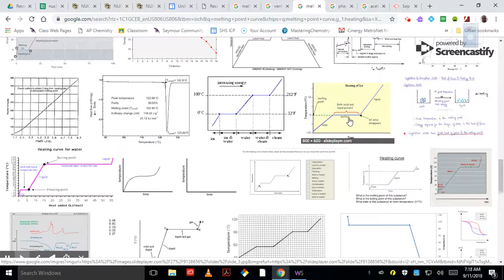Because if you mix acetanilid with acetanilid, you don't have a mixture, and you should see a fixed melting point. If you have acetanilid and you mix it with phenacetin, that'll make one of those bad mixes where you'll get a wide range on your melting point.